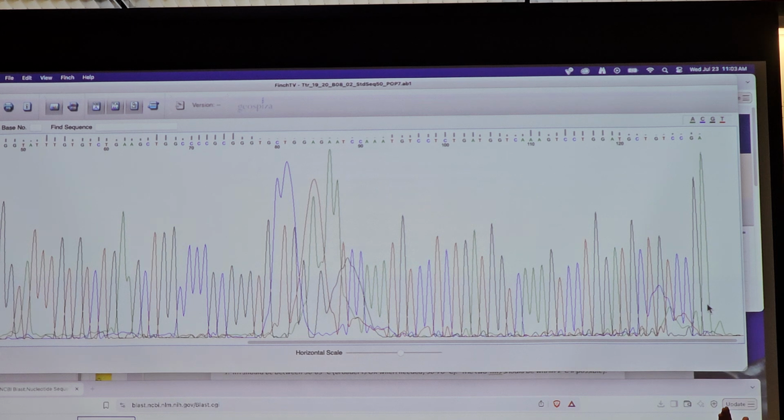Okay, so we had a 150 base pair product, right? The sequence primer is the forward primer. So you hybridize that primer. The primer, I think, was 22 or 23. And then you prime off the end of that. So you automatically lose 23 because of where the primer hybridizes. Then you start sequencing after that. Then you lose about another 10 because you can't read the first 10.